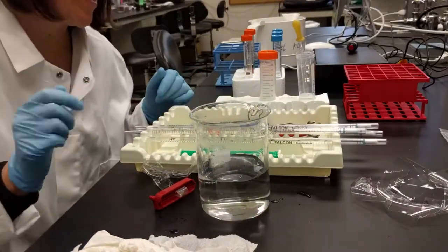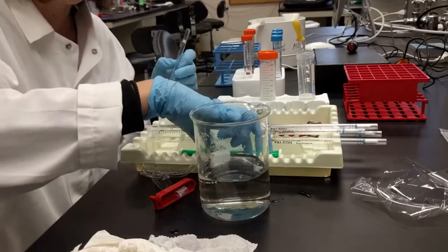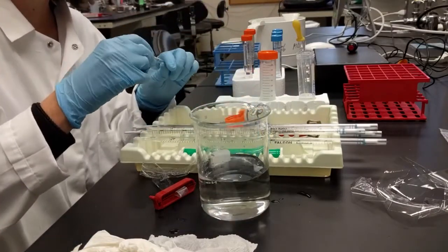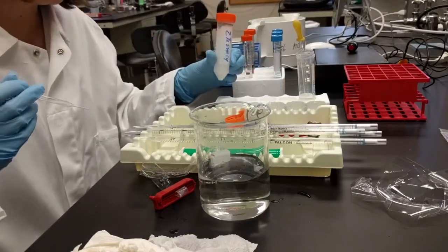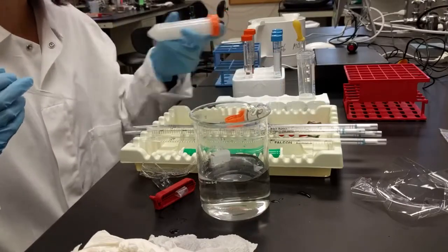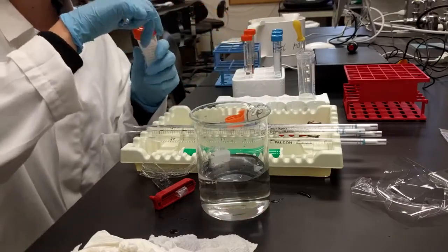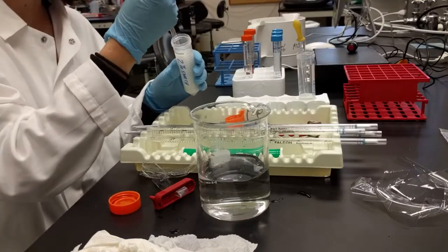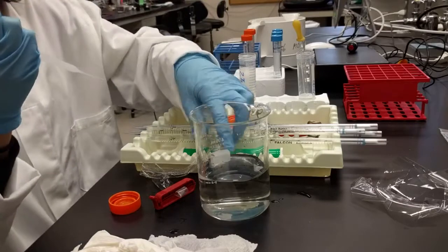Okay, next up, I'm gonna add about the same amount of starch. I'm gonna use a different pipette so we don't get contamination of our solutions. This is a solution of 2% starch, and I need to shake it up first because sometimes the starch will precipitate at the bottom. So I wanna make sure it's all mixed up. So I'll add about 5 pipettefuls of the starch.